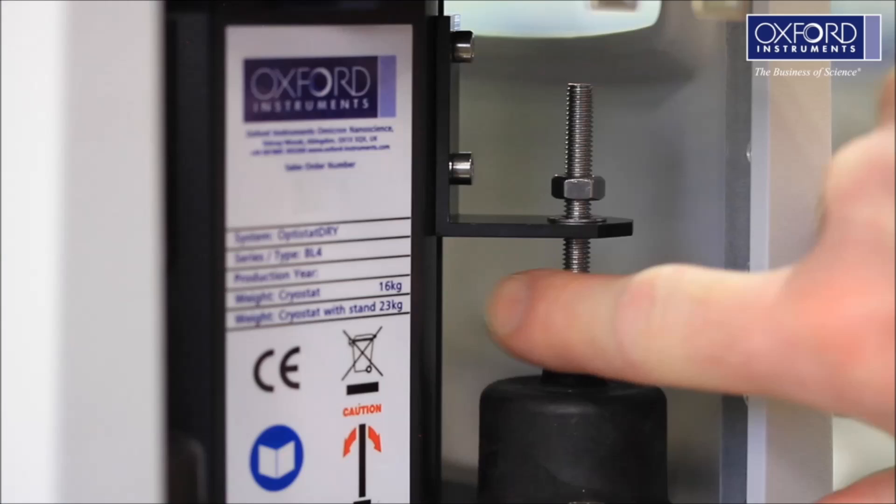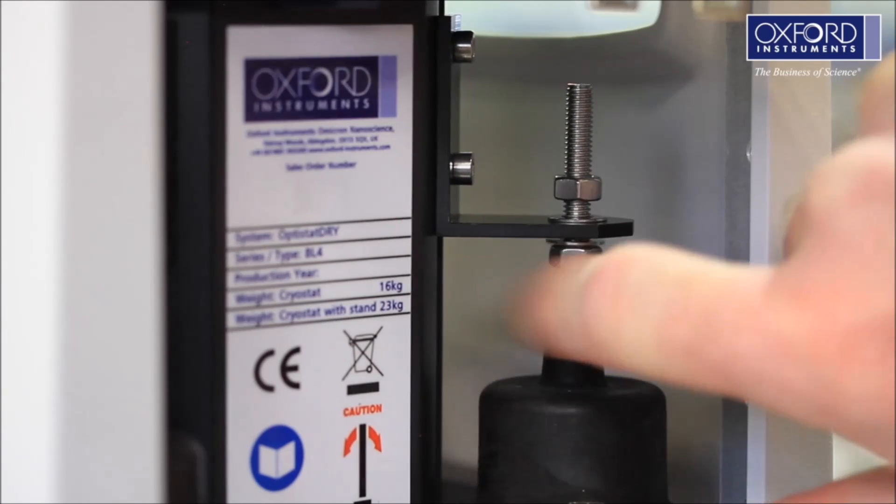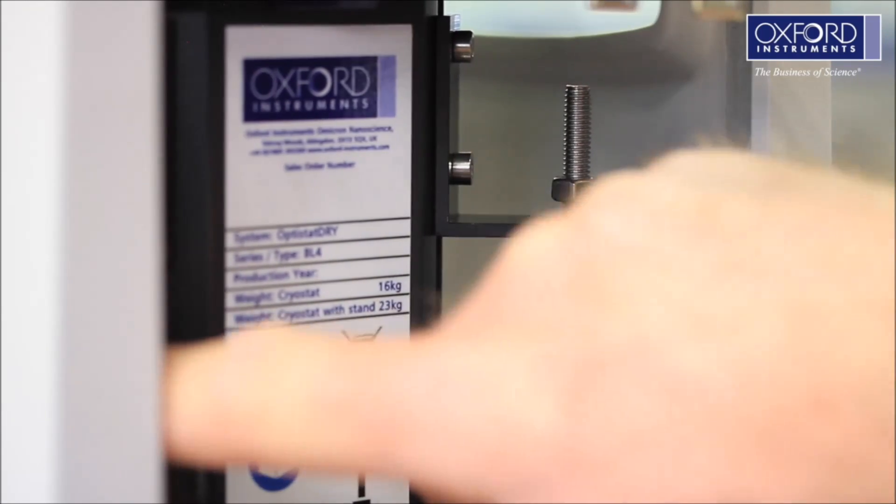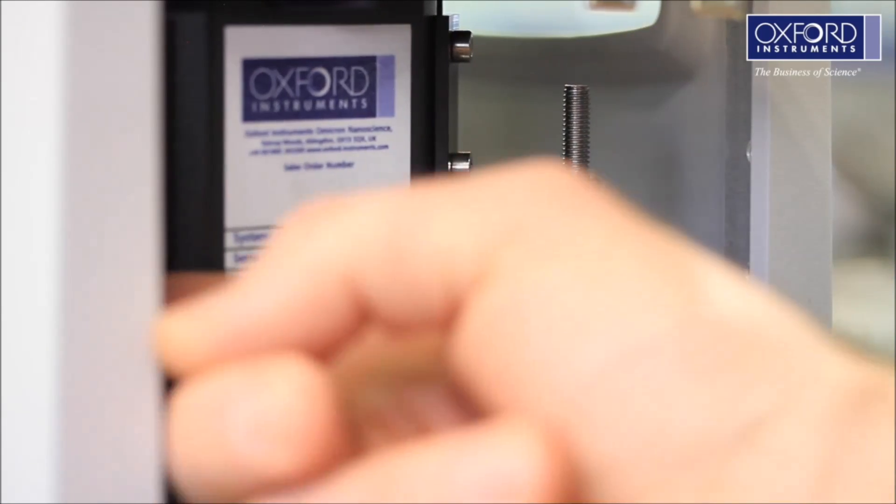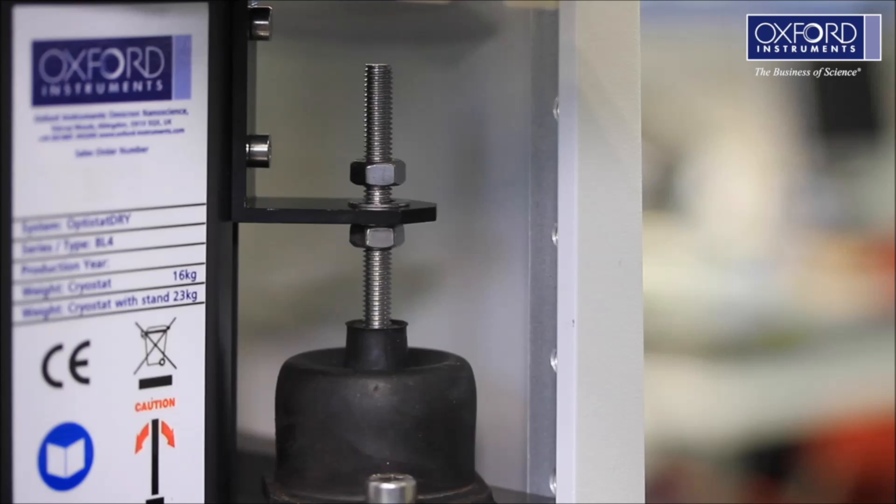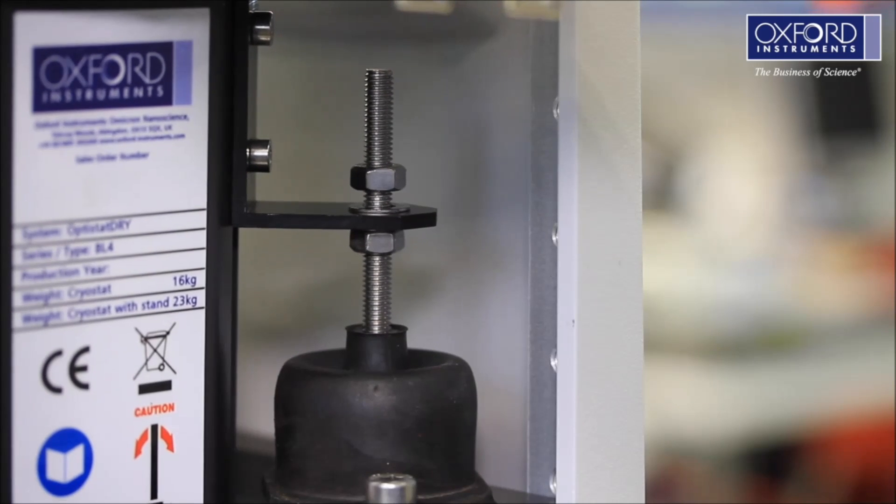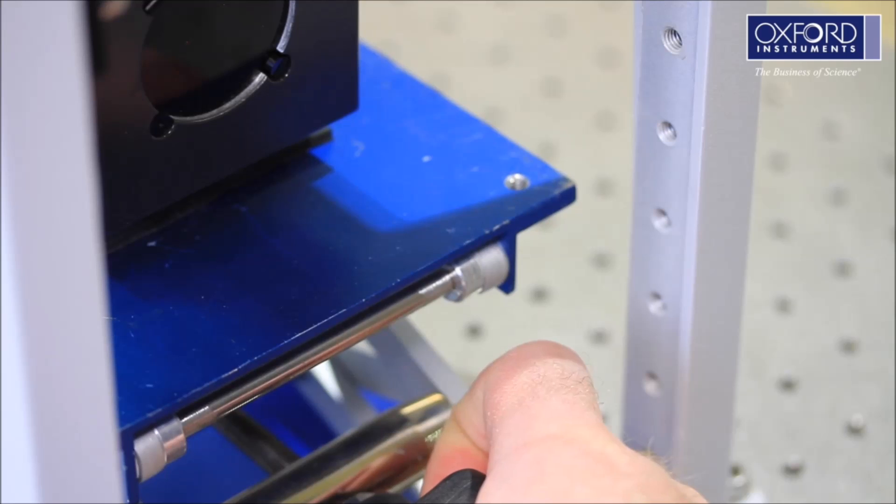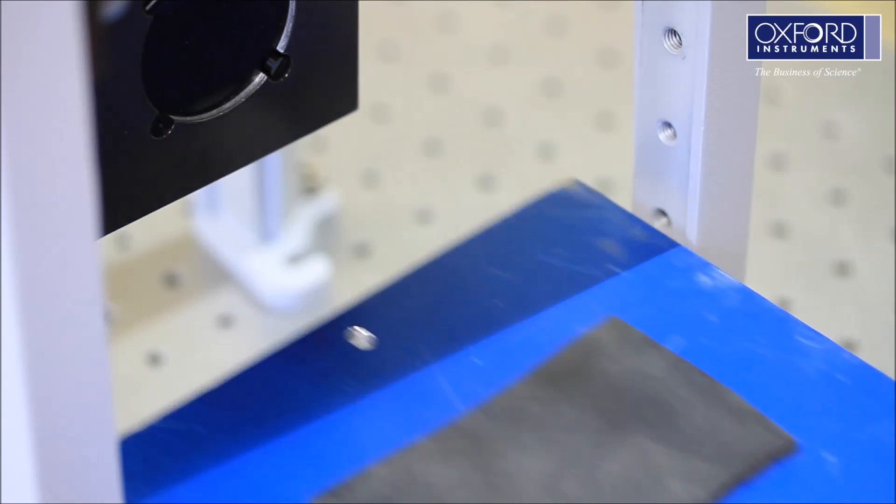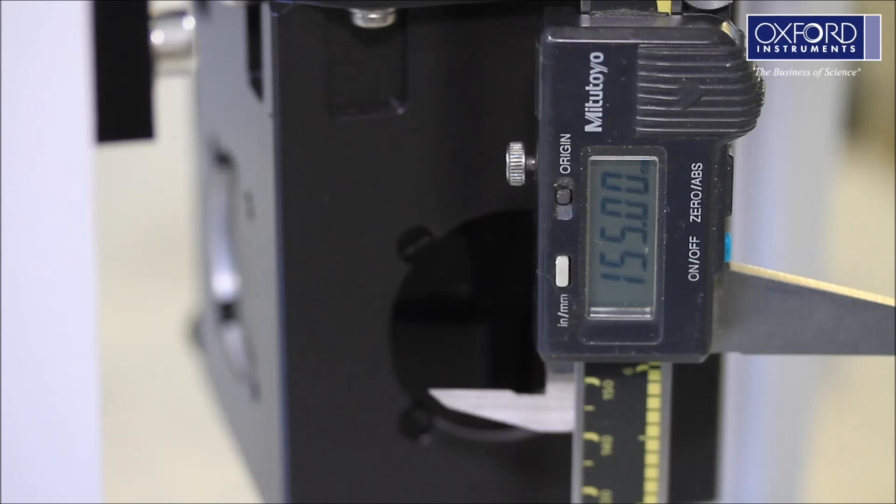When you get to the correct height, adjust all four lower M6 nuts so they touch the bottom of the L brackets. Lower the laboratory jack and remove it. When you do this, the vibration mounts will compress by a small amount. You may need to repeat this process to get the exact height you need.